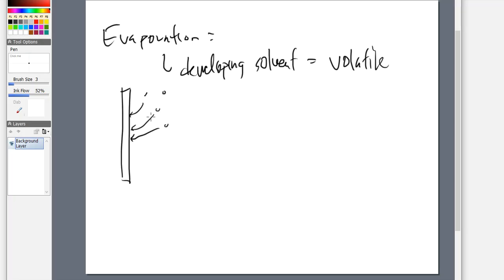And that gas phase can leach on the top of that silica, and it can stay there for a little bit. But you know, these things are volatile, which also means that once they go onto the surface of the plate, then guess what? They can evaporate all over again. So that evaporation step is also taking place. So I see a different type of evaporation in that area of the plate as things begin to travel and move.